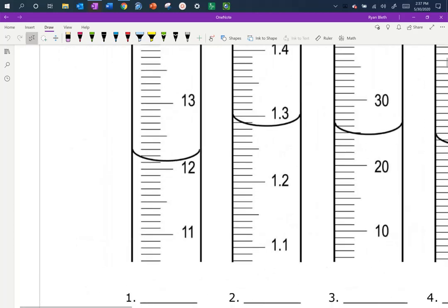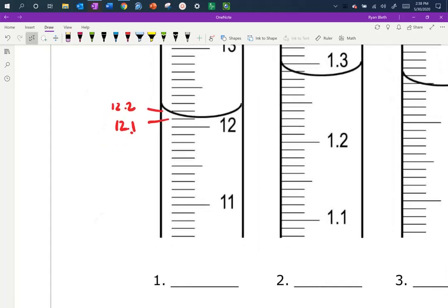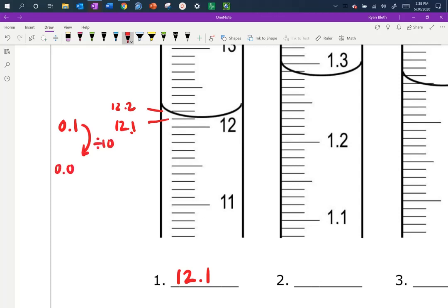Looking at the first picture, the main division is 12 and the next minor division above it is 12.1, then 12.2. The bottom of the meniscus — the lowest point — is somewhere between 12.1 and 12.2. Because the minor markings are to the nearest tenth of a milliliter, we divide by 10 and estimate to the nearest hundredth, 0.01 mL. So we need two decimal places, and the second decimal place is what we estimate.